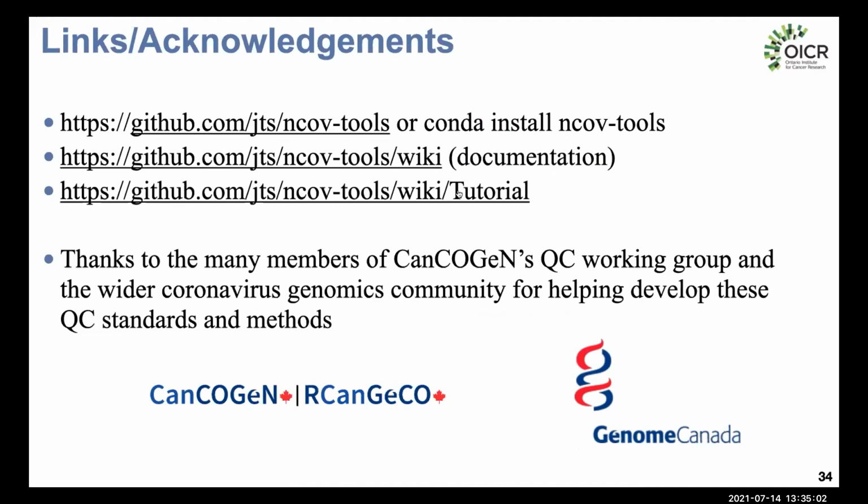And we've developed a tutorial where you can download some public data, run it through the Nextflow pipeline, and then run it through ncov-tools to generate a QC report like the one I just showed you on the previous slide.